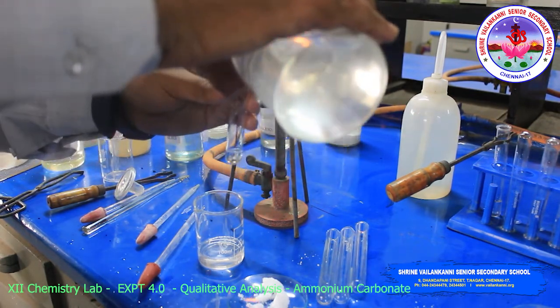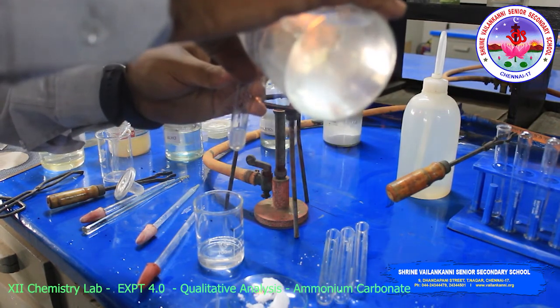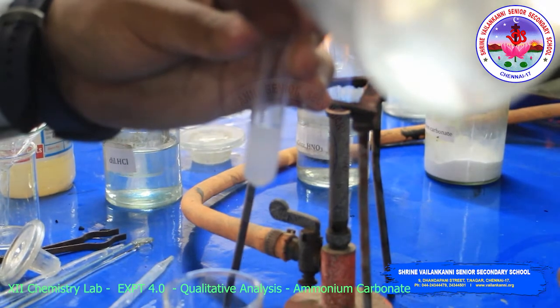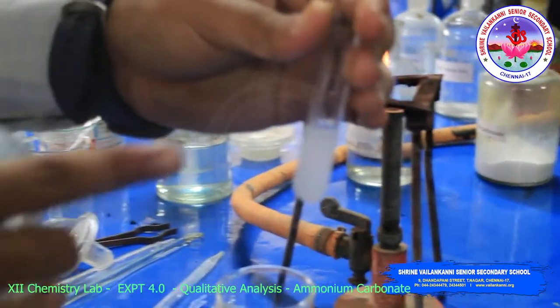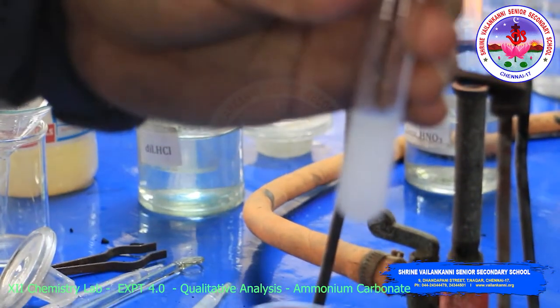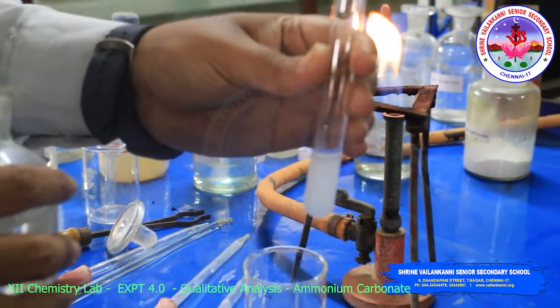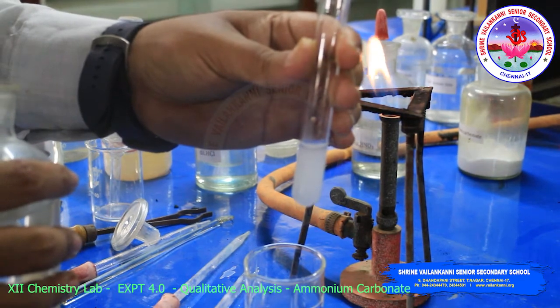A white precipitate is obtained, can you see the white precipitate? So carbonate is confirmed. The acidic radical carbonate is confirmed.